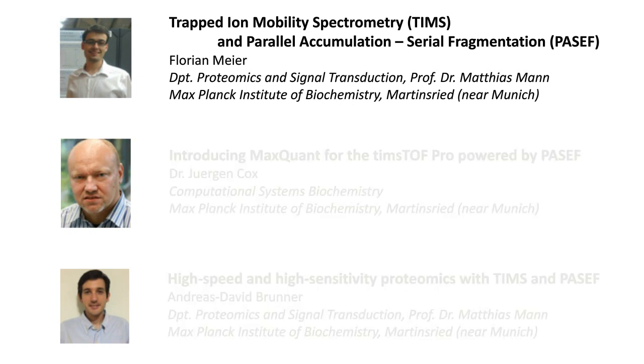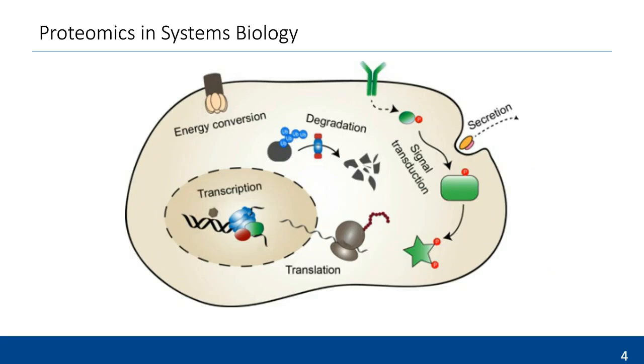So we'll start off with the technology part. But first of all, what is this technology good for? We use it for systems biology and in particular proteomics. So why are we interested in proteins? It's because they simply control all the cellular processes in our bodies.